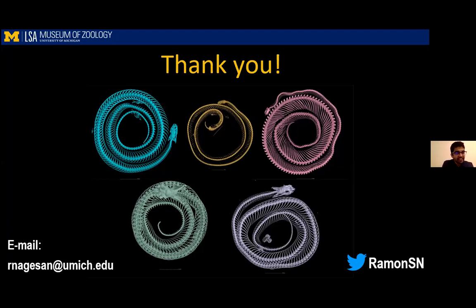Problems with fossils. Fossils offer a whole other set of challenges, generally speaking, because fossils are much more dense. They are a longer scan, sometimes at higher powers. You can use different filters to reduce some of the attenuation effects that the X-rays will have when they travel through various minerals that might be in the matrix around fossils. But we actually don't scan too many fossils on our particular scanner because the paleontologists have their own machine. They actually have the exact same scanner themselves.